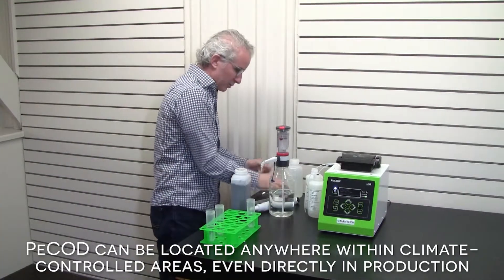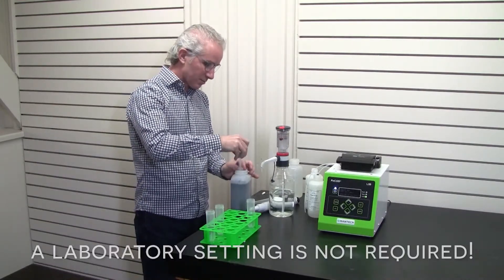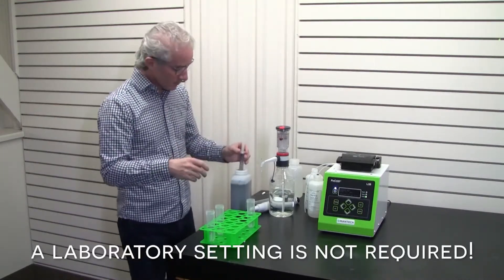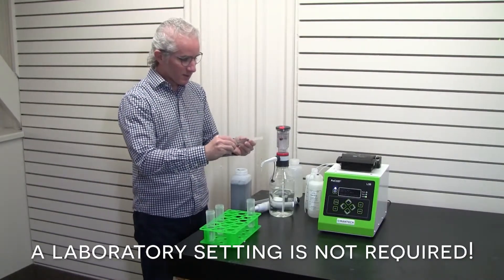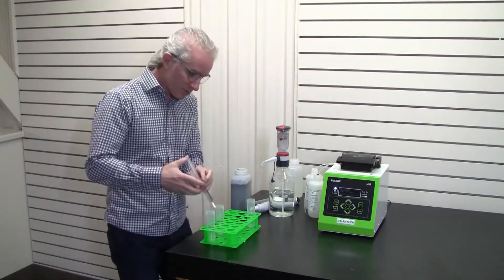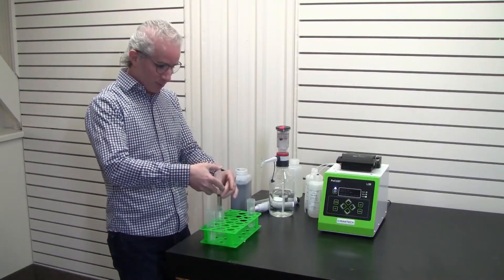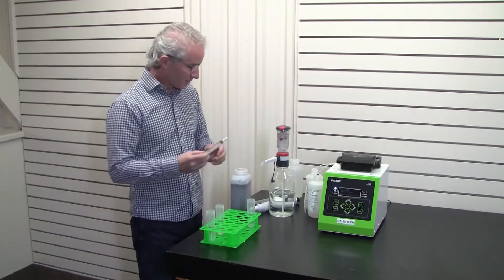With the syringe that we provide in the starter kit with the Peacock, just draw in the sample, then add the filter that we also provide in the starter kit and very easily attach it. Squeeze the sample through into a clean tube — very easy, just like that.